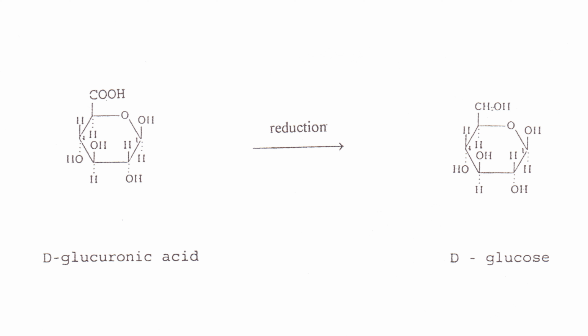Instead of trying to decarboxylate the glucuronic acid residues, I might be able to reduce them to glucose residues. All chemists know that if you want to reduce the carboxyl group in benzoic acid to give benzyl alcohol, you use lithium aluminium hydride in dry diethyl ether or dry tetrahydrofuran. But these polymers are insoluble in diethyl ether or tetrahydrofuran or any other ether solvents.